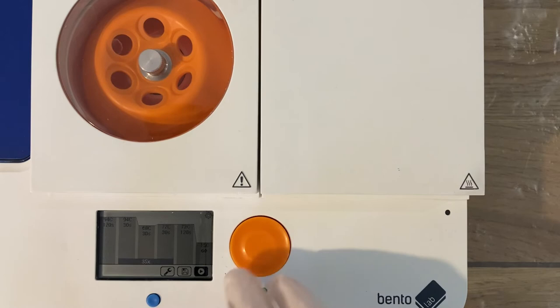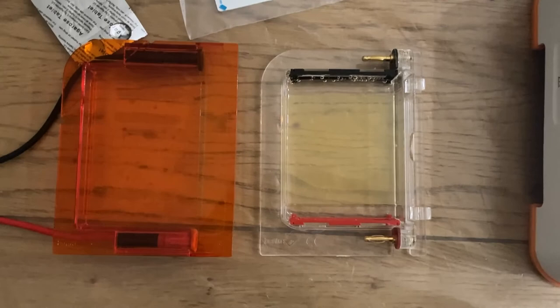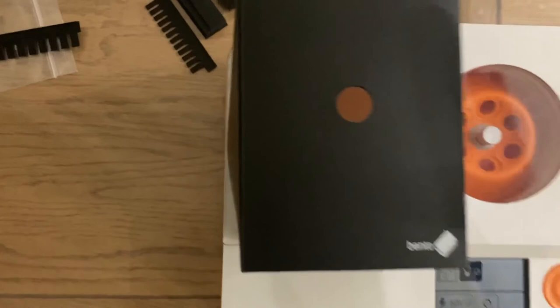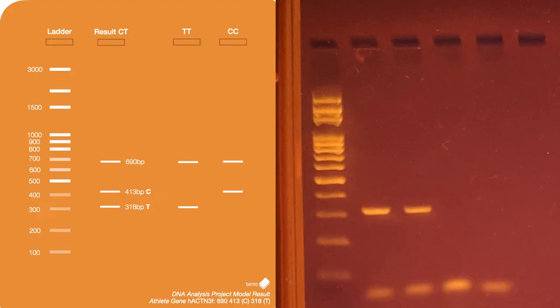Now for the moment of truth — to see if my human DNA extractions from spit have worked. I've taken the lid off the gel box, moved it onto the blue light transilluminator, popped the gel box lid over it, and switched the light on. Look at that — some beautiful bands! We have primer dimer at the bottom, but both DNA extractions worked. Now we need to check the guide to see what size that band is and which version of the allele I have for the athlete gene.